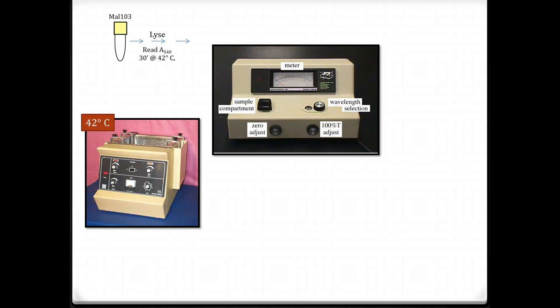But make sure you leave the entire unit turned on, and make sure you turn it back on whenever you leave the water bath. These samples need to be shaking. We put it at 42 degrees, of course, because we need to disable mu-C and cause these cells to begin to induce the phage. So you're going to put them at 42 degrees for 30 minutes.